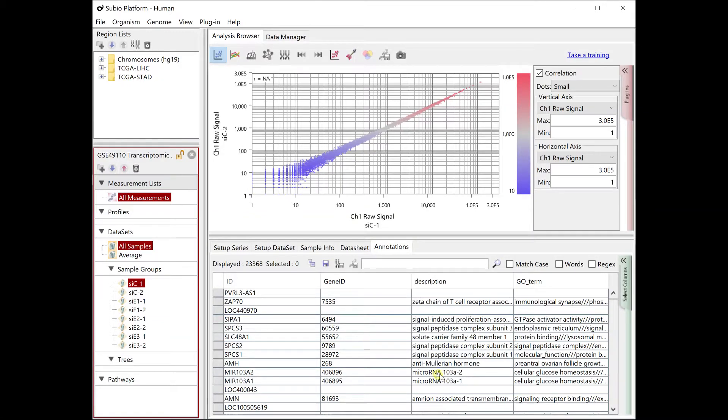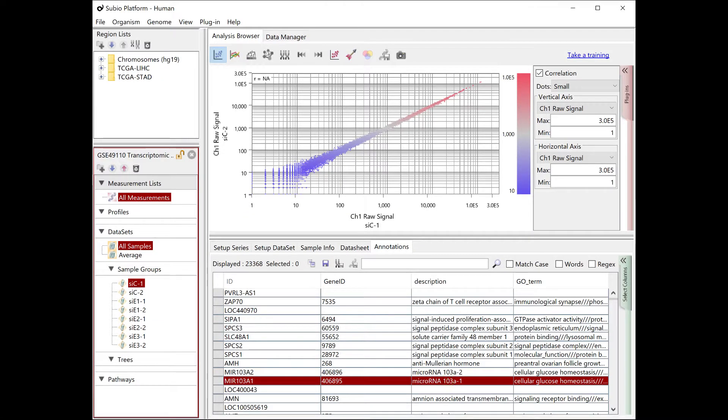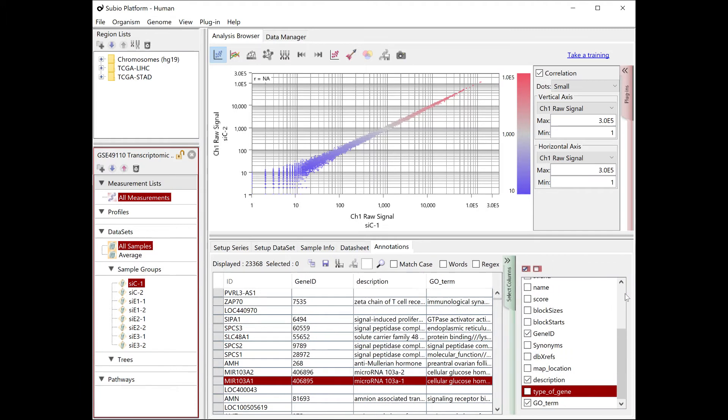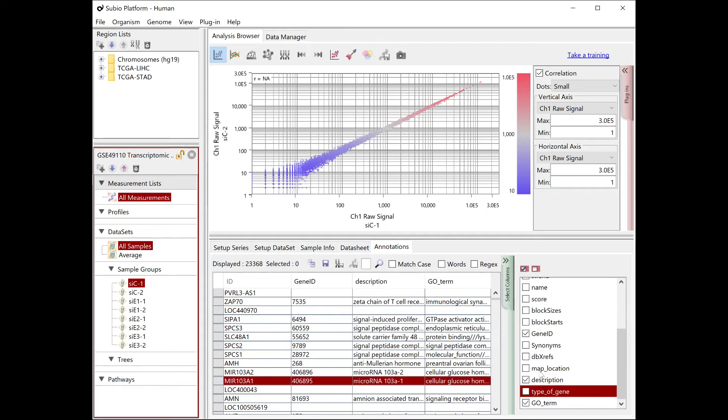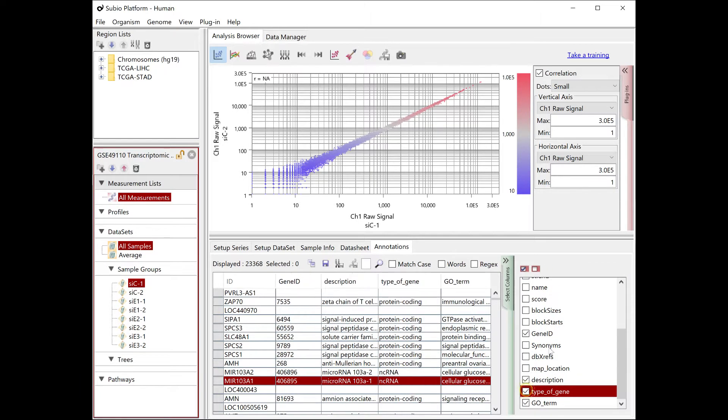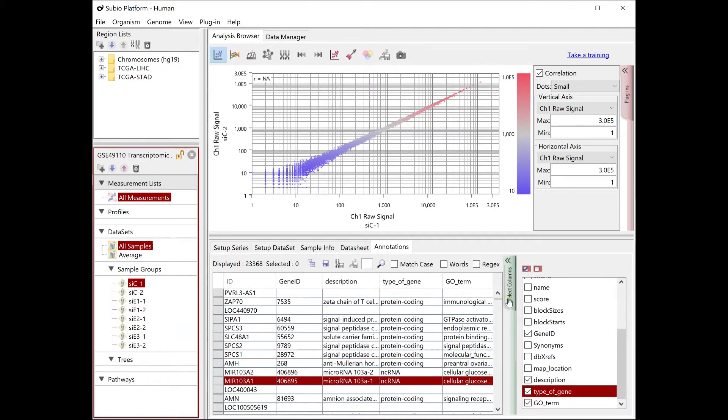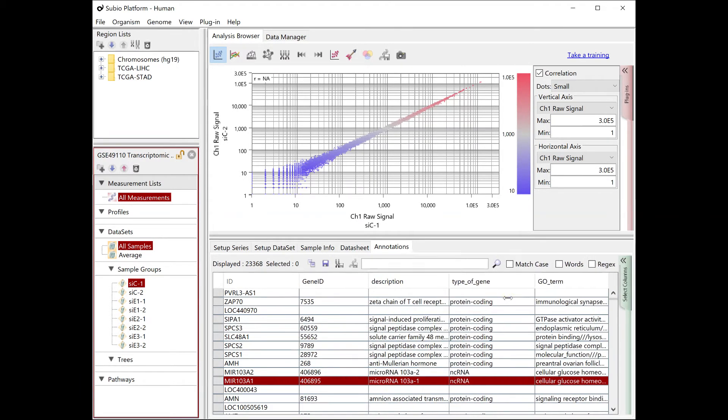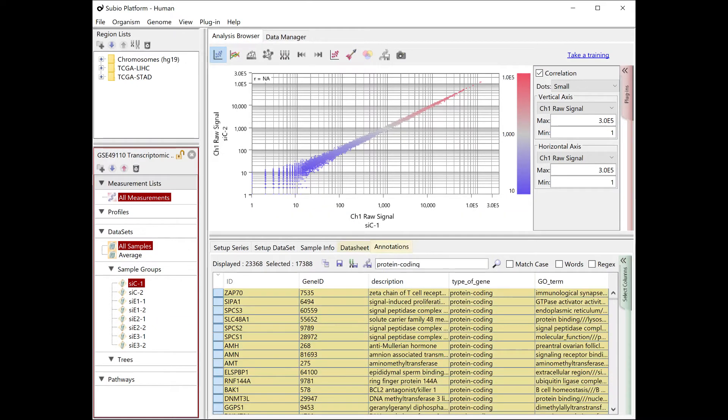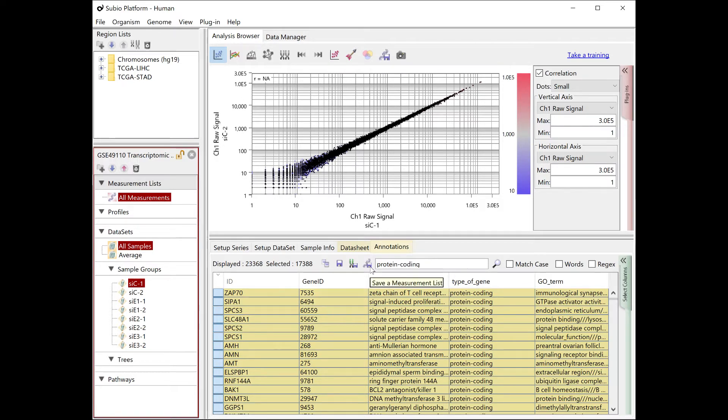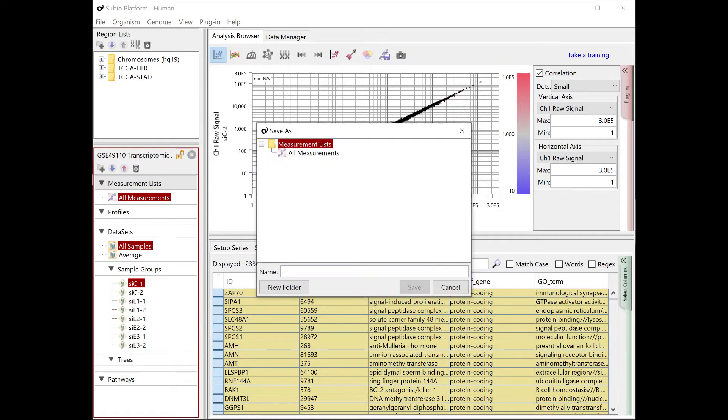RNA-seq data often includes measurements of transcripts that can't be measured. Exclude any types of RNA that are not supported by the library kit used. Extract the protein coding genes and save them as a QC1 list.